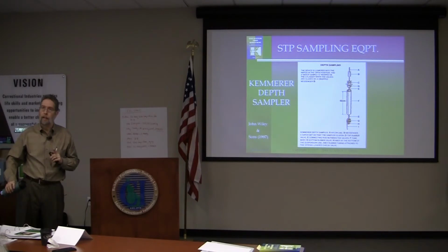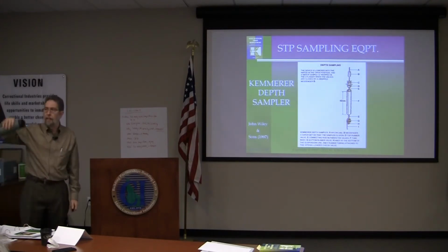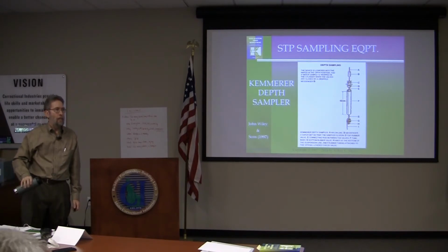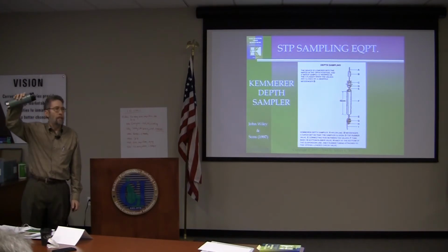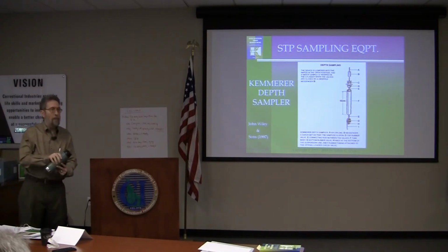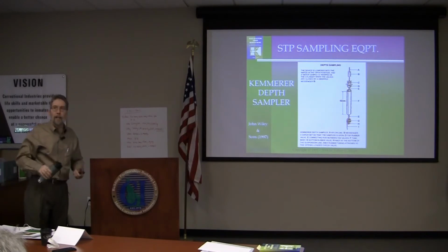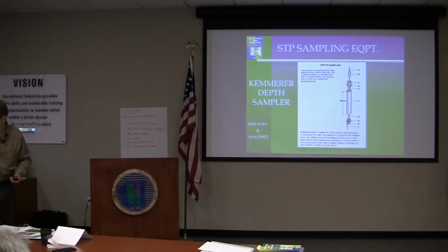That's a good thing, because you might want to say, what's my vertical profile from the bottom of the stream bed up to the top? So over the course of 2 minutes, you can slowly raise it and get a very representative sample all through that vertical section. Or if you want to do across the stream, you can put these on a pole and do even a zigzag all the way across the stream. Or if you're in a boat, you can go to different locations. So it's a really cool device, and they've only been out a few years.